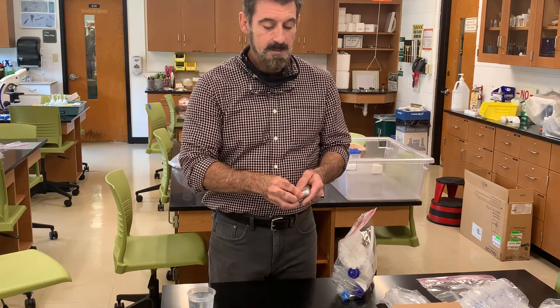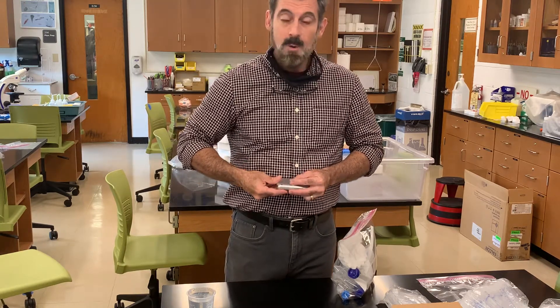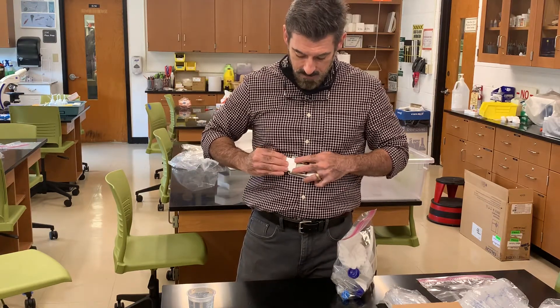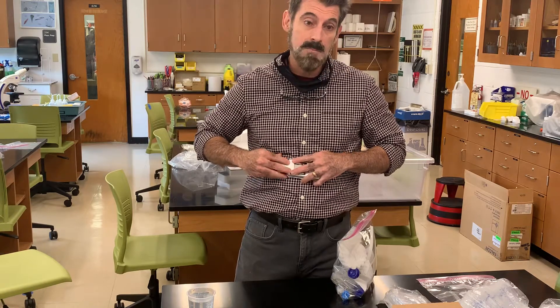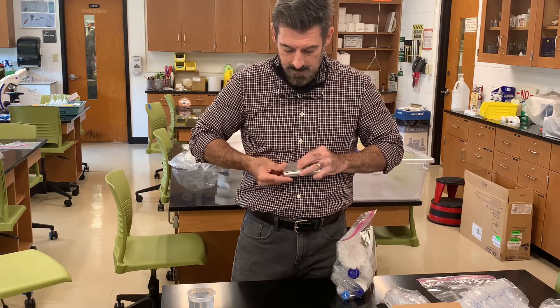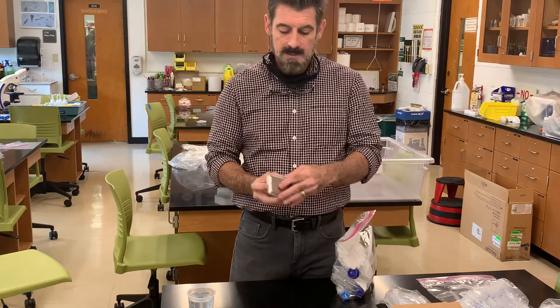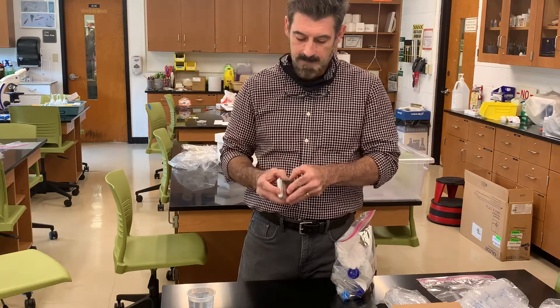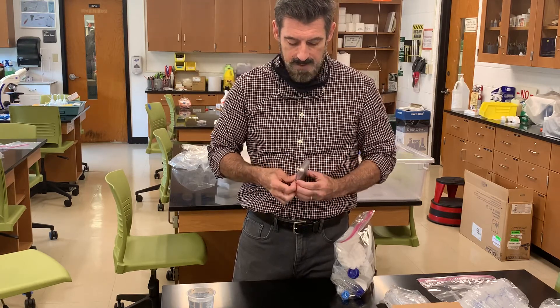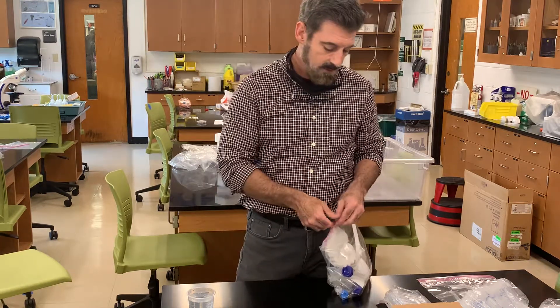I tested out several of these throughout the summer and all of them worked very well. Some were more expensive than others; the college purchased ones for all students. The only thing is the purchased ones don't come with batteries, so you will have to get your own triple-A batteries. You'll use this in one of the first labs — the calibration lab — and also for preparing molar solutions and a variety of other things.